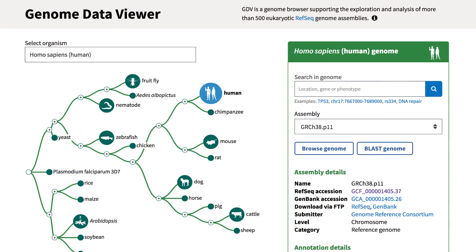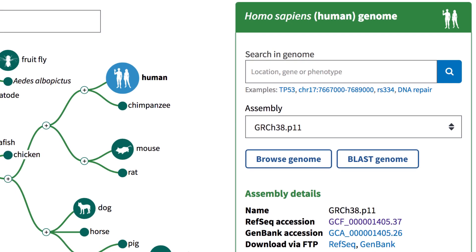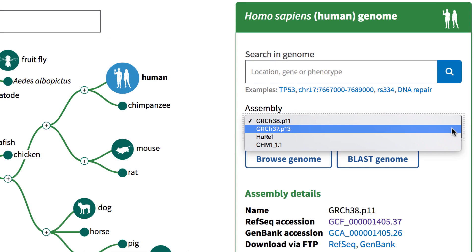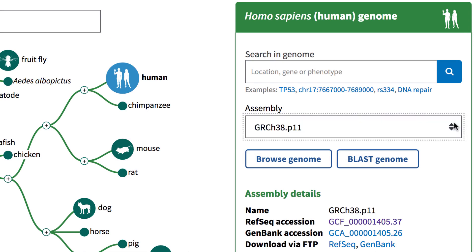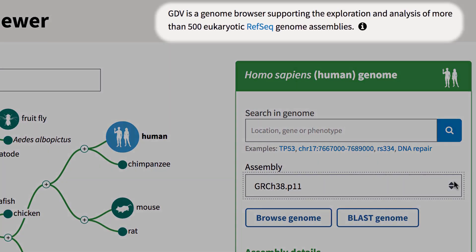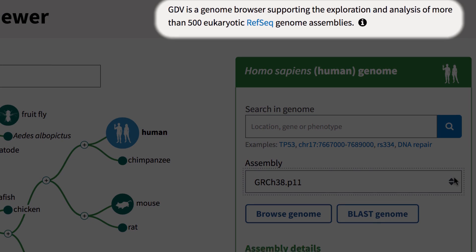You may be surprised to learn that a good place to start your BLAST search is right on the Genome Data Viewer homepage. Here you can choose the exact assembly version that you want to search. Keep in mind that this BLAST interface searches the top-level sequences that are part of RefSeq genome assemblies, which number well over 500 eukaryotic genomes.